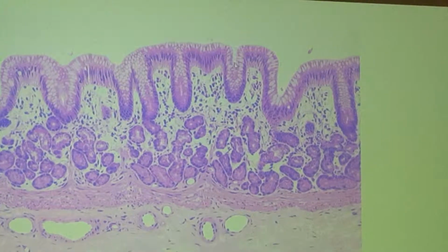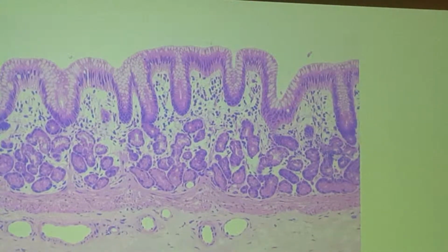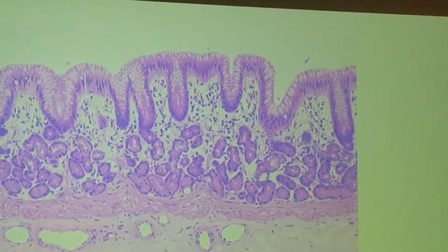That was number 16. 17, I said name this layer, submucosa. Number 18, adrenal gland. I asked you to name the organ. Adrenal gland. Number 19, name this layer, zona reticularis. You might not have known the vocabulary yet for that, but if you understood it as the third layer in, then you're in pretty good shape.